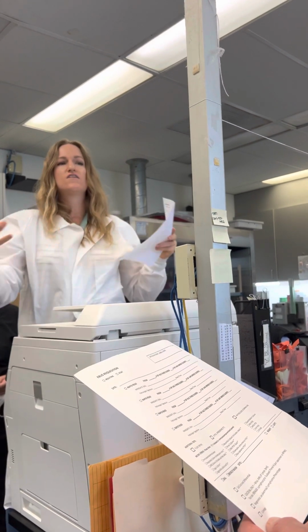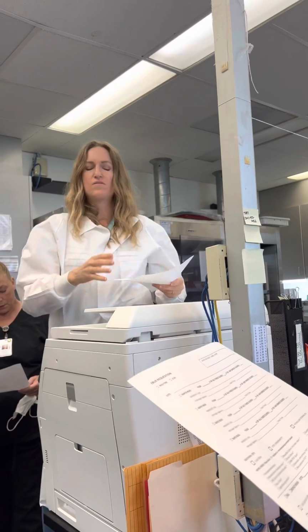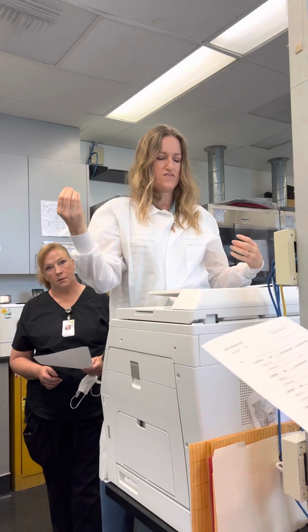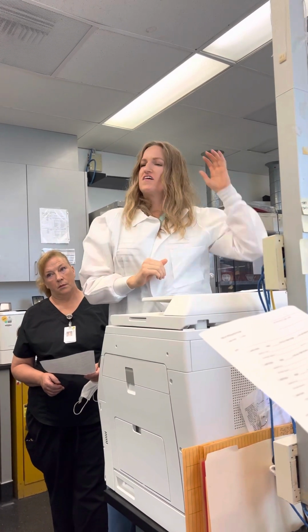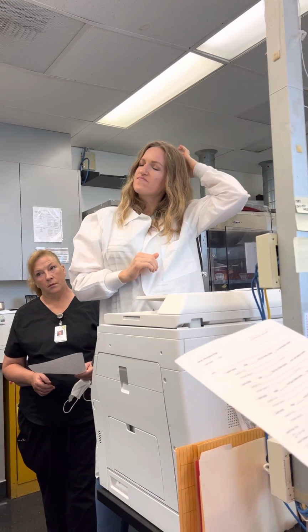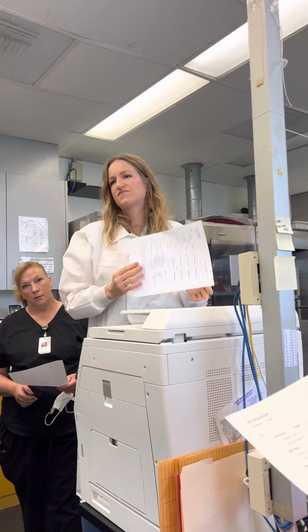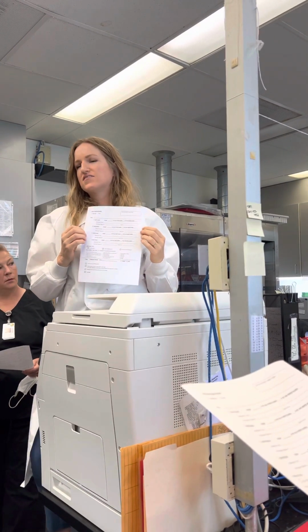It's a lot easier to do it site by site rather than receiving multiple sites on a paper and having to sort it out. It's kind of like a puzzle, and we're like, wait, this RPMI is here, but we don't see flow listed anywhere. It'll really help with missed orders. You know how on a lot of these we'll miss, maybe micro got missed, or flow got missed, or cytology got missed, especially with the BALs or the bronch washes.